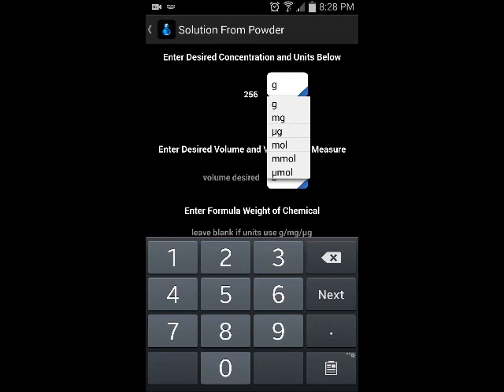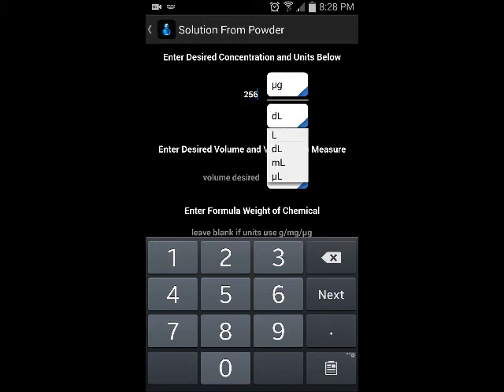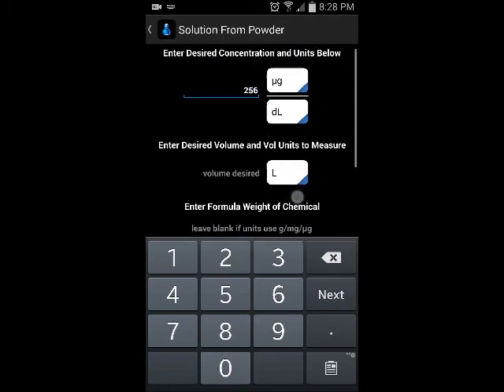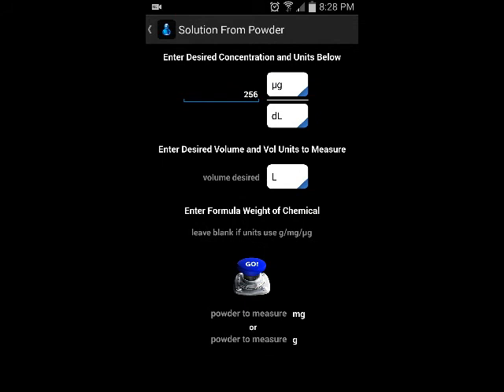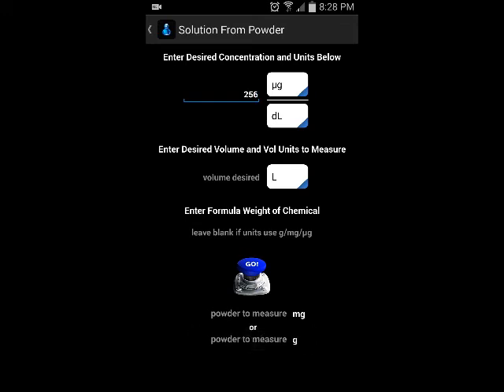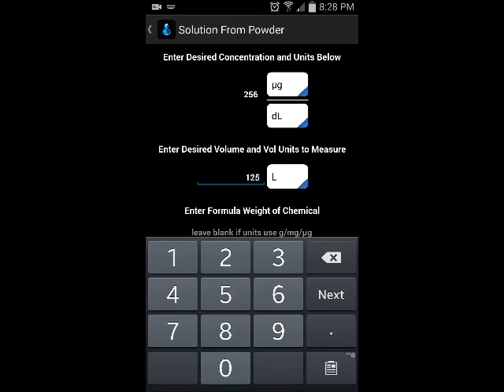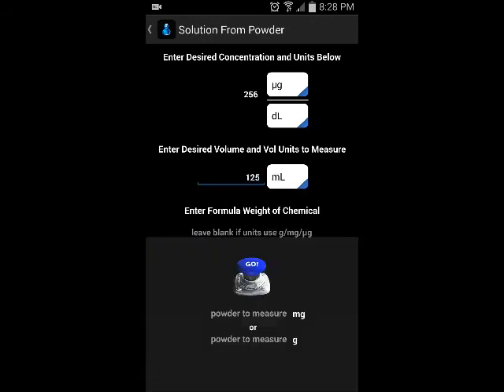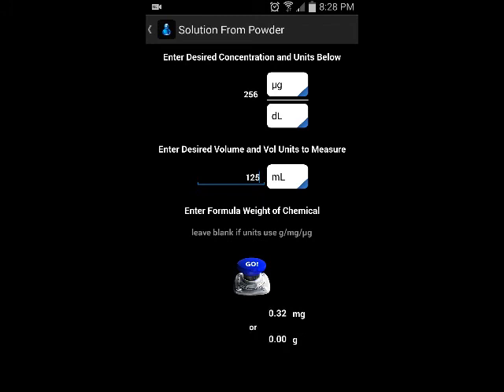What I like about the app is the number of units available — it's very flexible. I added deciliters because that's common for some pharmaceutical scientists to use, such as myself. The app is designed to be user-friendly, so if you forget to enter something and hit the go button, it's going to prompt you to enter the desired volume. That's going to immediately give you your answer. We're making a solution that's a little too dilute — 0.32 milligrams — which will be quite difficult unless you have a microbalance.